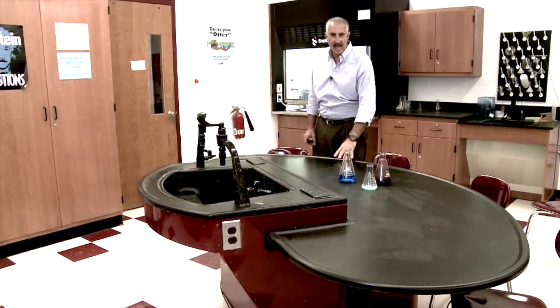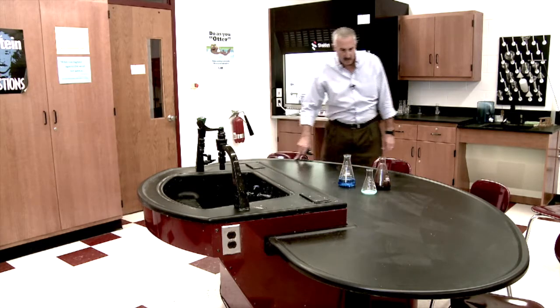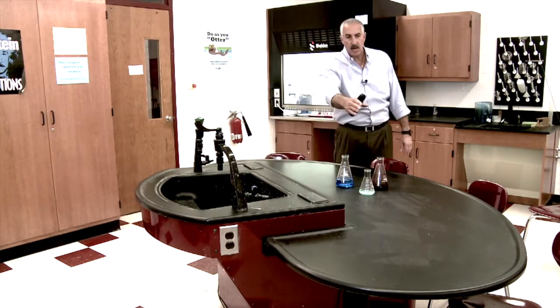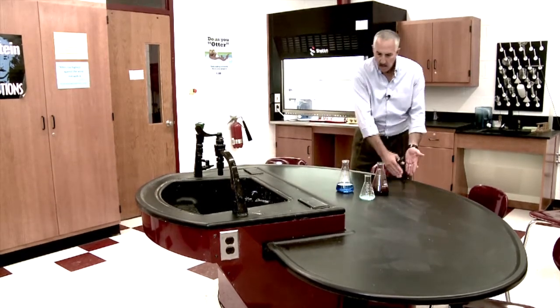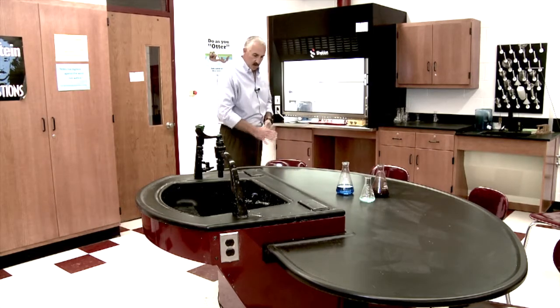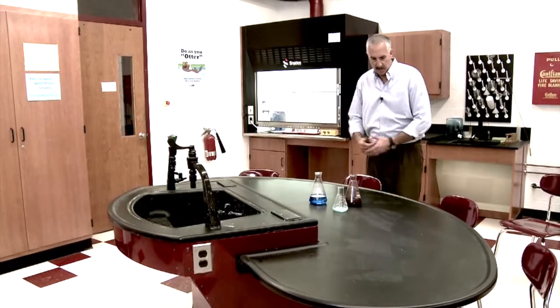This is the Access Infinity 8-foot table. The table comes in two different sizes, 8-foot and 7-foot. We're looking at a curvilinear shape of the table, and from one side to the other side, 96 inches across — or if you can picture a 4x8 sheet of plywood — 47 inches to the front and 8-foot across. As you can see, comfortably four students sitting around the table, giving them over 30 inches of workspace each.